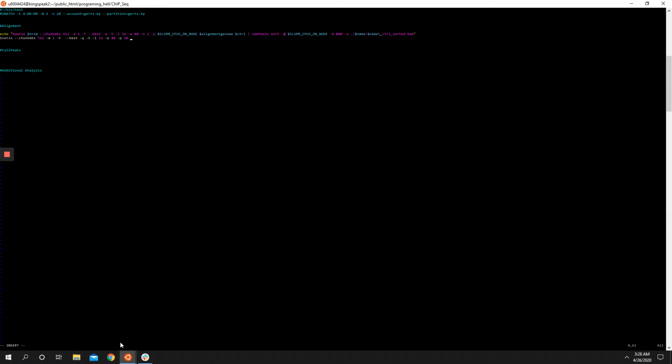So then you would have typed that out, and then HG19 is the prefix, and then we would give it an output name for the file.